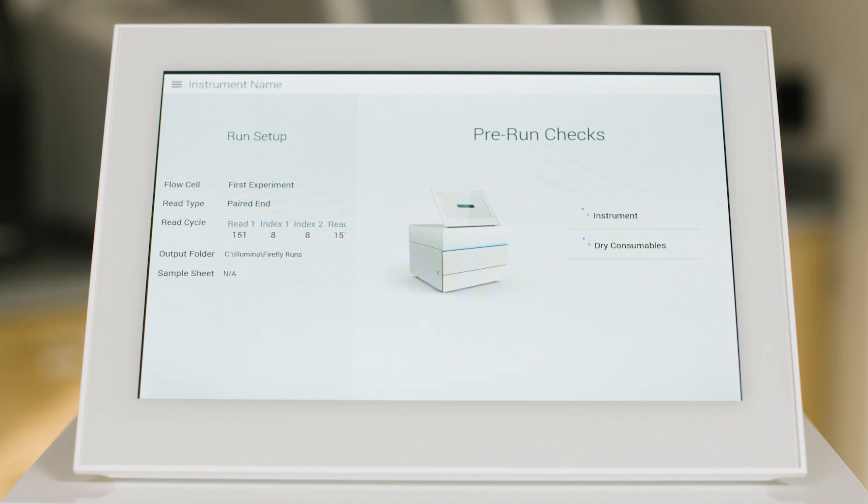It's here where you will notice the similarities to previous workflows on other Illumina sequencers. From preparing samples for clustering to the intuitive user interface, both experienced NGS users and those that are new to NGS technology will find the iSeq 100 to be a refreshingly simple solution.